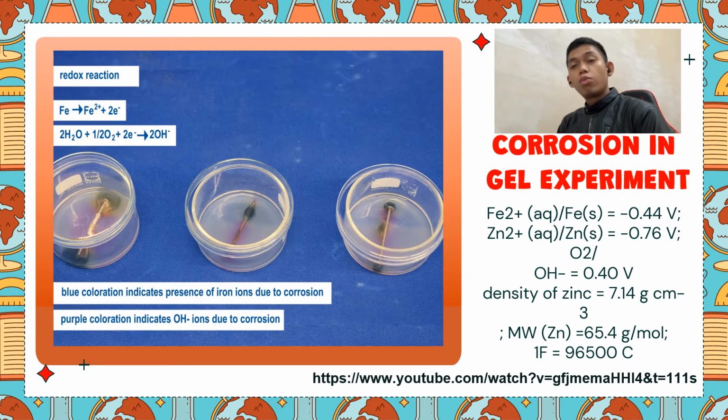Then we wait for several days to make sure the experiment occurs perfectly. There are several colorations: blue indicates the presence of Fe2+ ions due to corrosion, and purple coloration indicates the OH- ion. Then there are some redox equations, or half equations, of the corrosion.